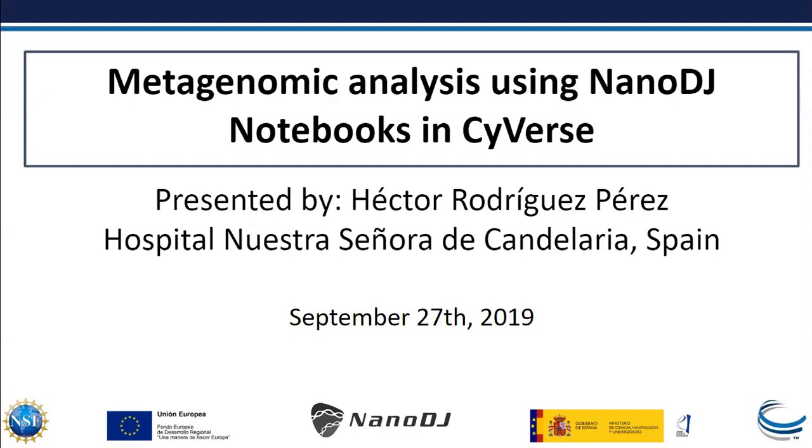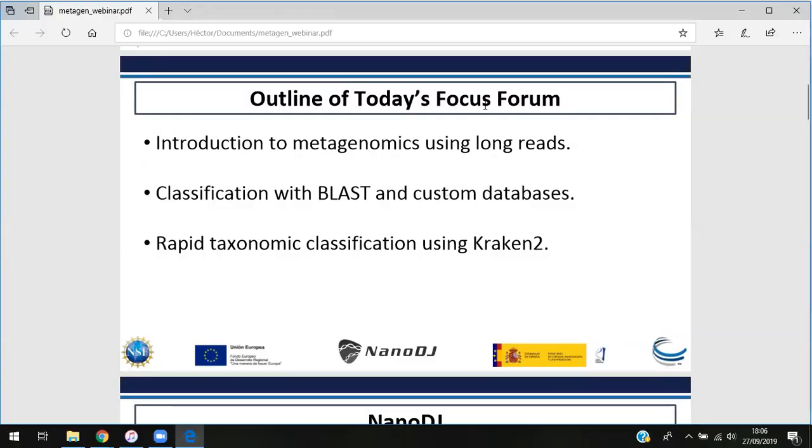I actually have a tech background, as you said. I studied computer science and software engineering, and now I am into this amazing field that is bioinformatics. Today we're going to talk about metagenomic analysis using NanoDJ notebooks in CyVerse. Throughout this webinar, we are giving an introduction to metagenomics and its applications, and then we are going to perform different analyses with two different methodologies. First of all, we are going to build a custom database using the BLAST classification tool, and then we are going to perform a rapid taxonomic classification using Kraken 2.